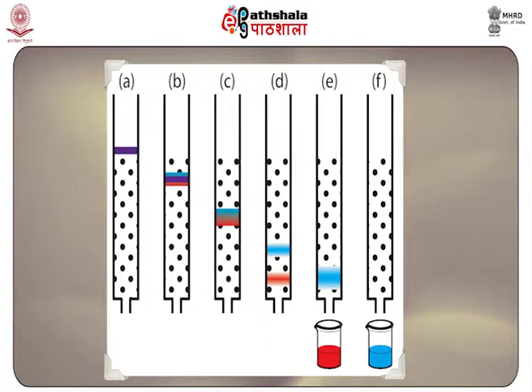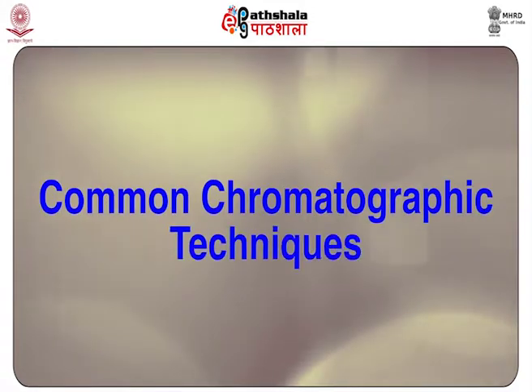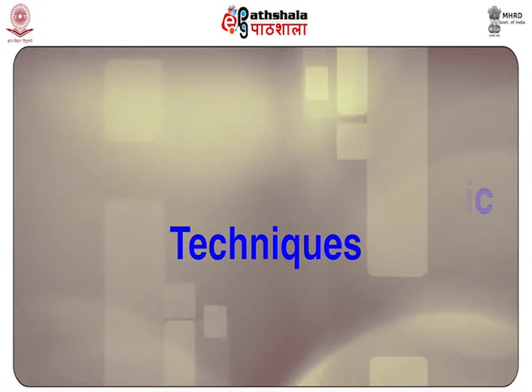The stronger the interactions between the polar analyte and the polar stationary phase as compared to the mobile phase, the longer will be the time of elution. Now, moving on to common chromatographic techniques.